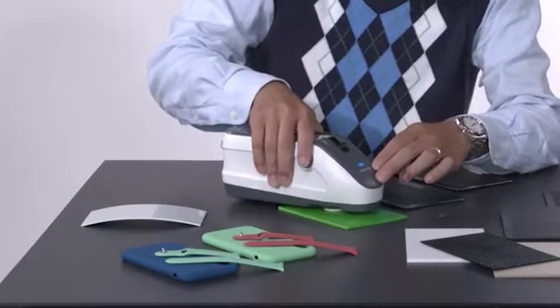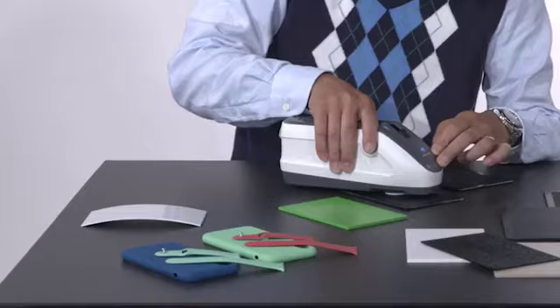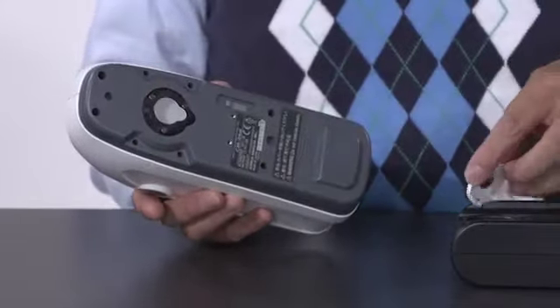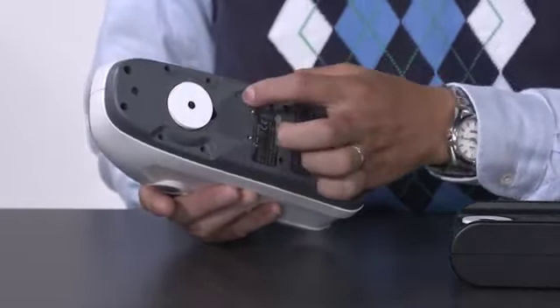The CM26D is the instrument of choice when measuring textured, curved, matte, or glossy surfaces that are light to dark in color, and can switch between 8mm and 3mm measurement areas. Simultaneous specular-included and excluded measurements are performed to ensure consistent color and appearance.